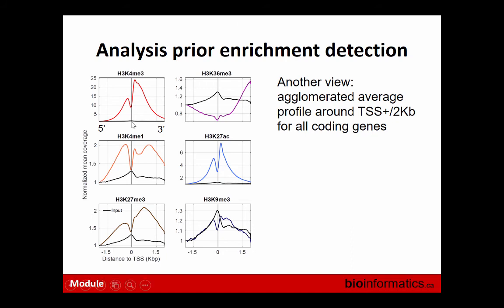You can see that there is a gap at the TSS, which represents a missing nucleosome, and then you see the increase of coverage inside the gene at the 5' UTR or first exon, and then it winds down in the body of the gene. On the right, there is H3K36me3, another mark, which is an elongation mark. This mark covers exons or the gene body of actively transcribed genes. So at the transcription start site, it's still missing, but then it starts growing, etc. We can learn something from this type of profile.